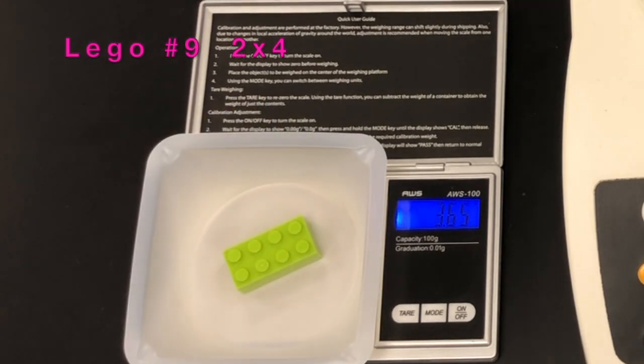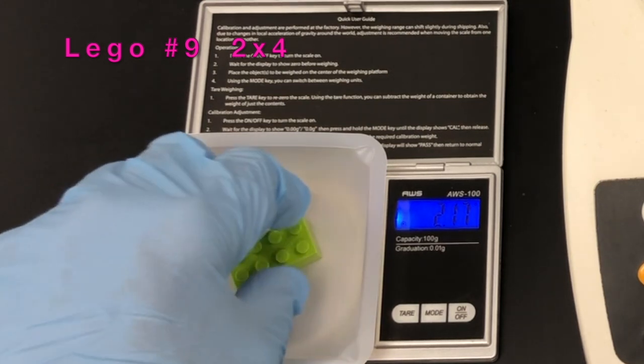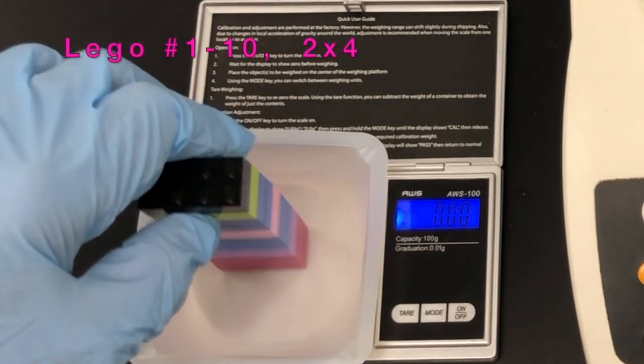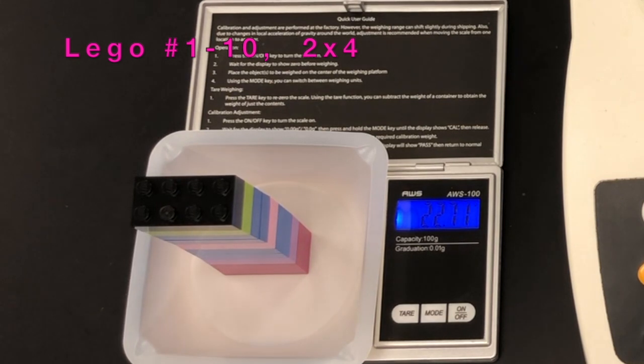We're coming up on the ninth brick and then the tenth brick. All ten bricks, numbered one through ten, are then put together and placed on the scale. The mass shown is the total mass for the ten bricks. To get the average mass, take that value and divide by ten.